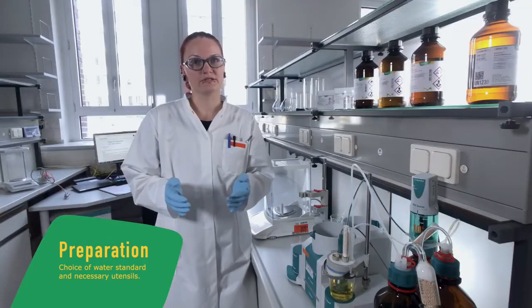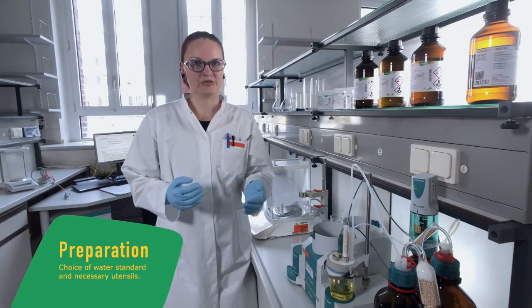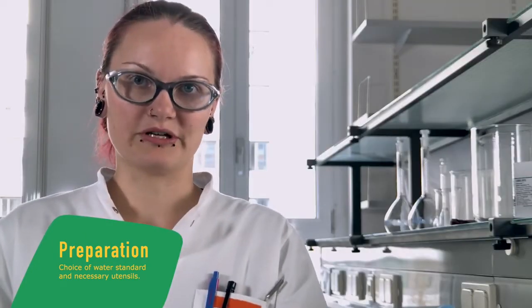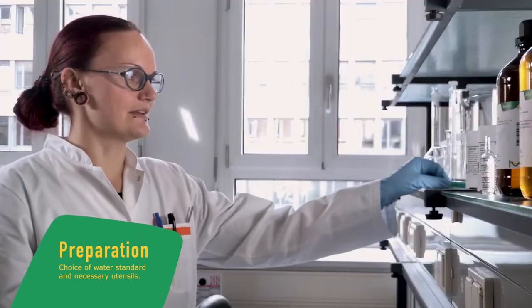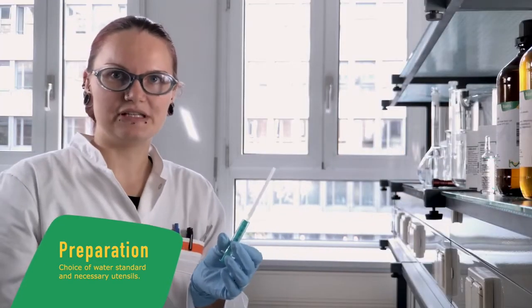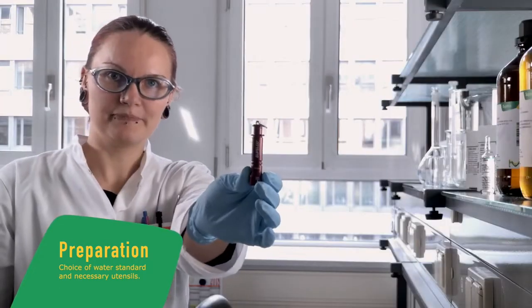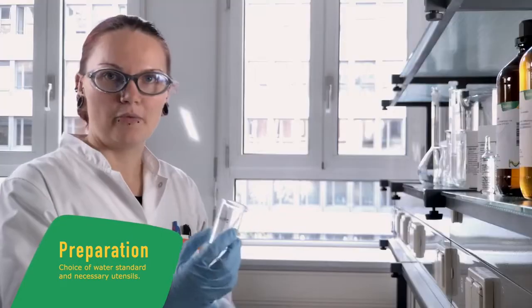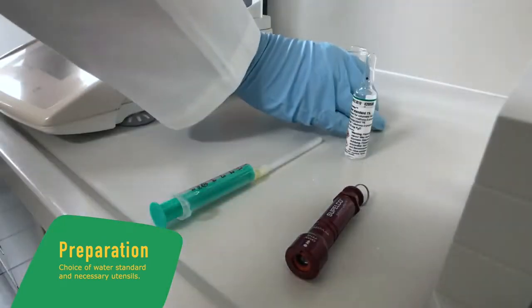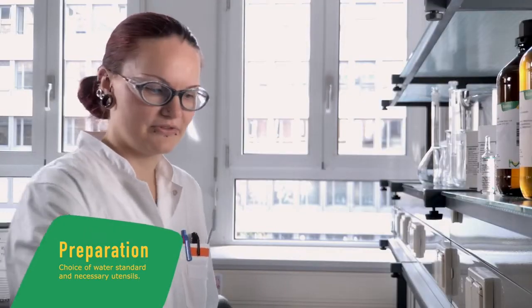The other option is to use a solid, which is sodium tartrate dihydrate, which has a very high water content but a limited solubility in our solvent. Then a syringe with the needle in the right size, an ampoule opener to open the ampoule safely, a waste beaker, and a tissue to wipe off the last droplet of the needle.